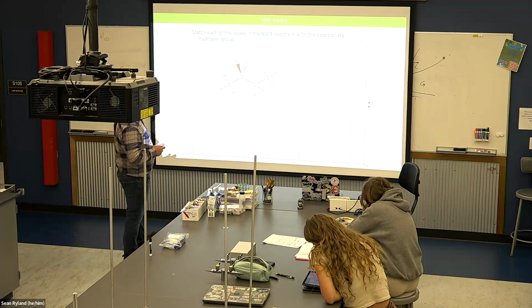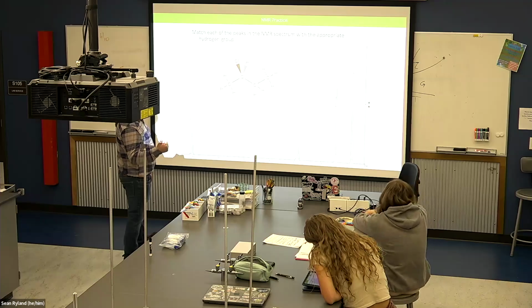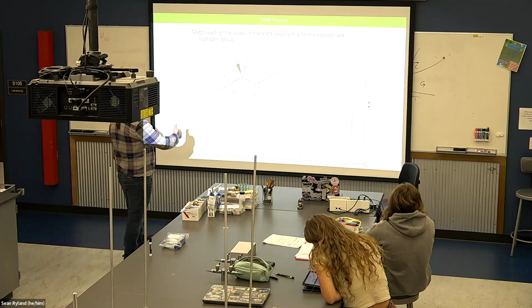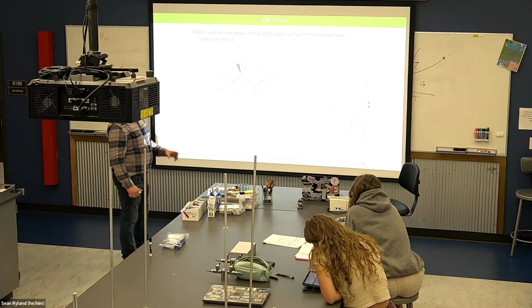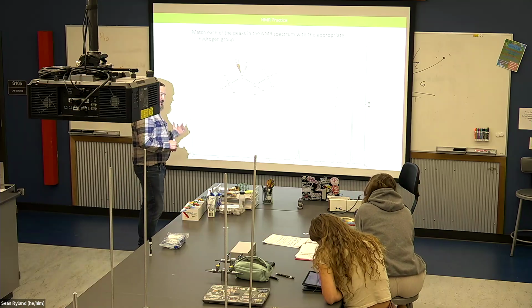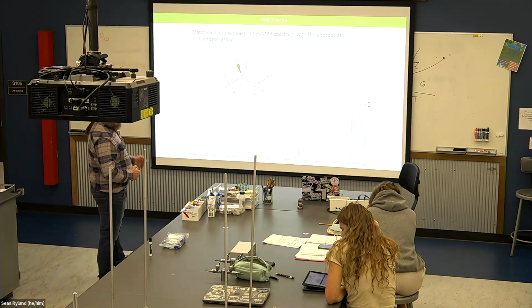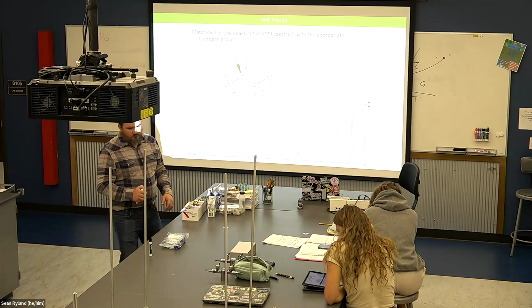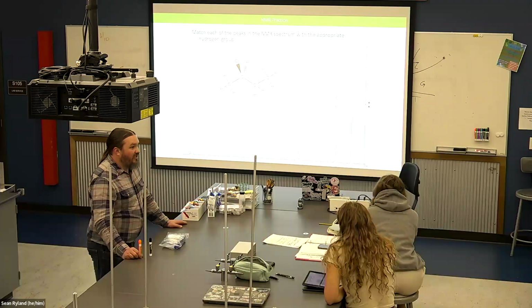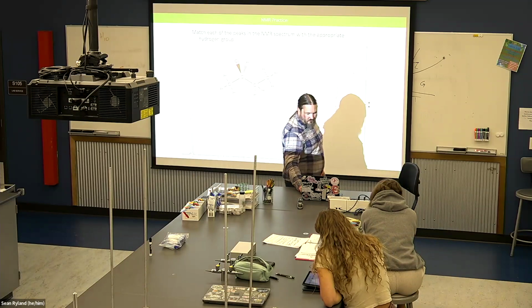So this is a really good example because this one can be done almost entirely from the integration, and just based on the peak splitting or just based on the shielding. You can pick any of the 3 approaches and then confirm it using the other 2. The number of peaks is always the number of neighbors plus 1. Exactly. That's what we call that N+1 rule.